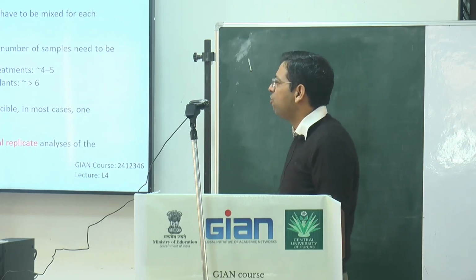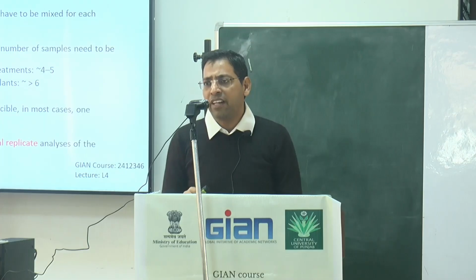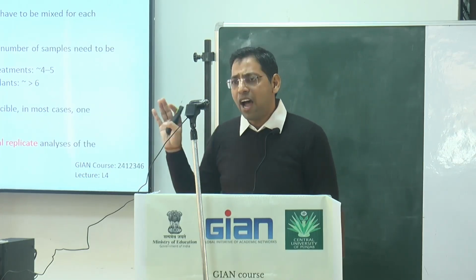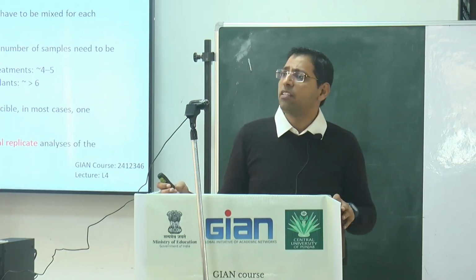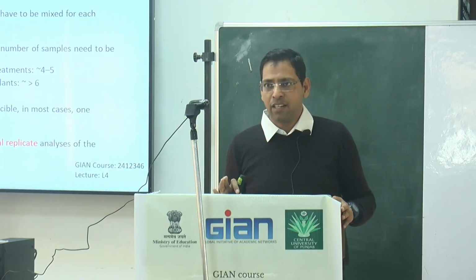If we are using different time points after infection, it varies. I would recommend 4 to 7 biological replicates to track the biological variation of your sample as compared to another sample.